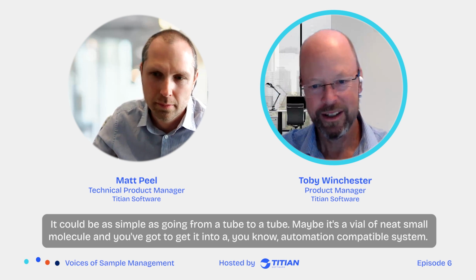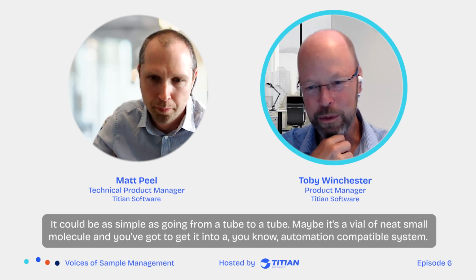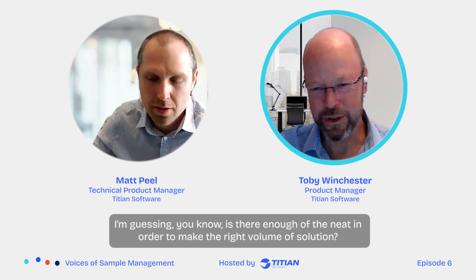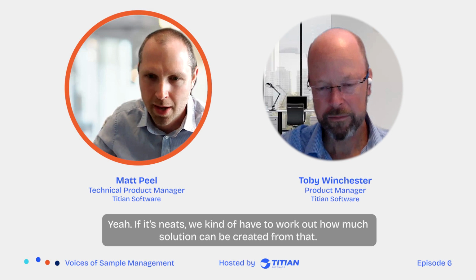Okay, and I suppose let's talk about one of those workflows. It could be as simple as going from a tube to a tube. Maybe it's a vial of neat small molecule, and you've got to get it into an automation compatible system. What sort of things have to exist in that workflow? I'm guessing, is there enough of the neat to make the right volume of solution? Obviously, if it's neat, we're going to have to work out how much solution can be created from that.